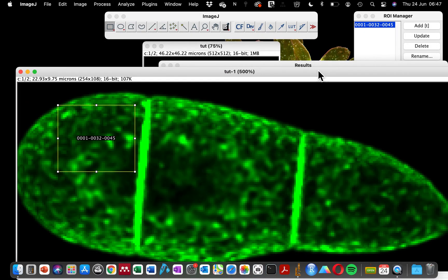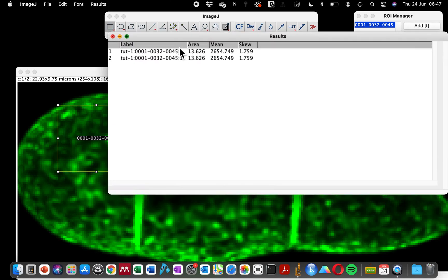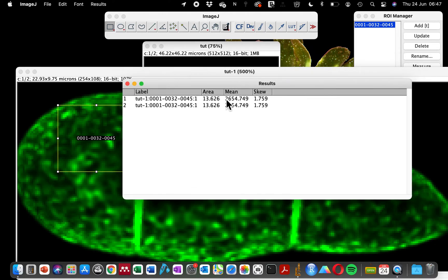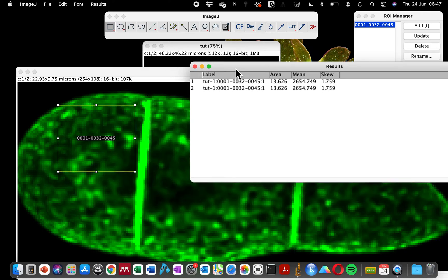After clicking Measure, a results page opens which gives us the details of the selection we ticked in the Set Measurement panel. We selected the area of the region of interest we drew and also the mean gray value. You can see here the mean gray value of the fluorescence intensity is showing 2000 plus. The skewness is also showing because we ticked that in the selection parameters.